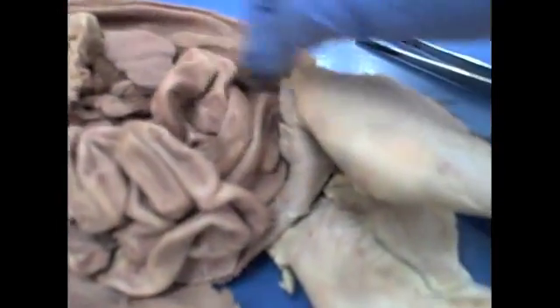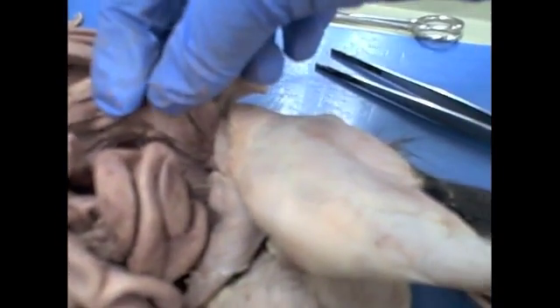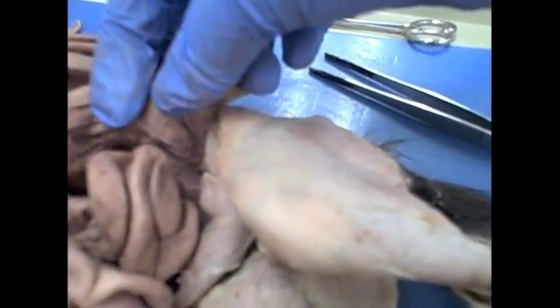From the small intestine, it goes to the large intestine. And the kidneys are right here. They filter and remove waste products in the body. At the beginning of the large intestine, there's a sac-like projection called the cecum.